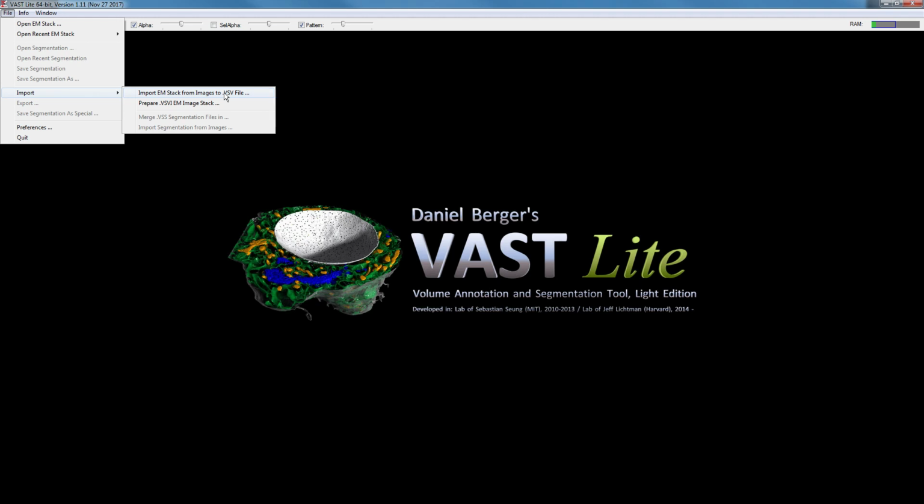And then it will also generate MIP maps, which means powers of 2 reduced images that will also be stored in that same file. So that means that your data has to be small enough so that you can actually put it into a single file. We have used that for datasets of maybe up to 1 terabyte. Maybe a little bit larger than that, but beyond that it really takes a very long time to do the pre-processing, and instead of importing it all into a single file, it's preferable to actually leave it as images.